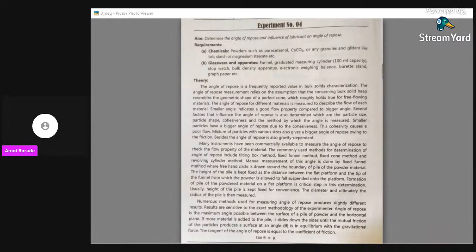Okay, so to continue with our discussion, we have considered that we have already made the granules of an active ingredient, and we have incorporated the glidants in that granule. So we got a blend of active and glidant. This glidant will allow our powder or granule to flow properly and desirably from the hopper up to the die cavity.